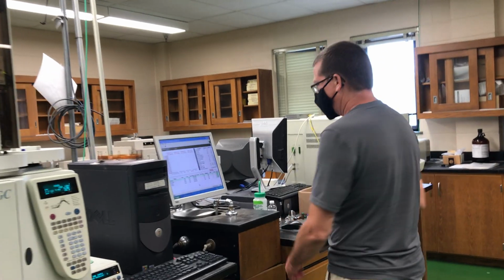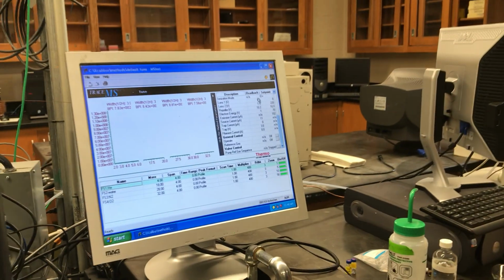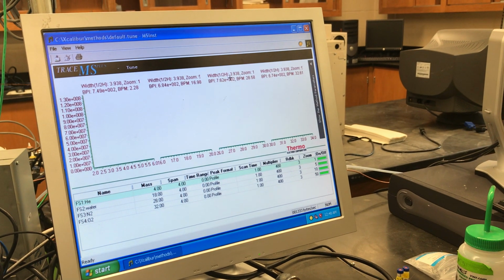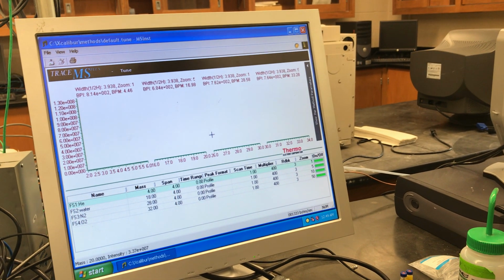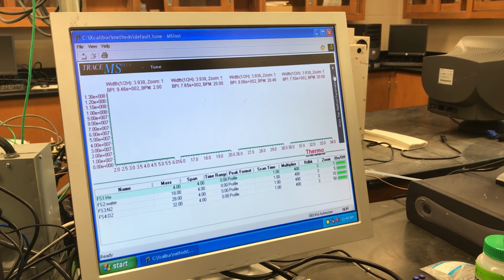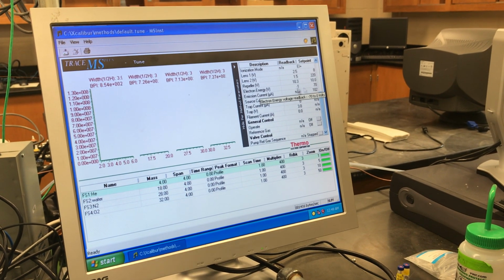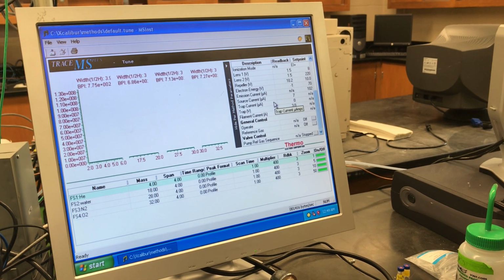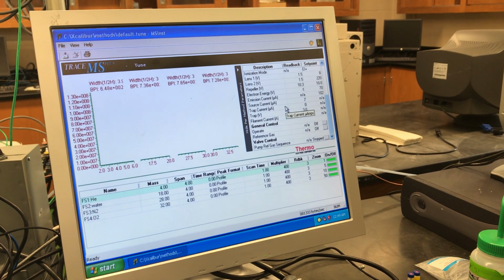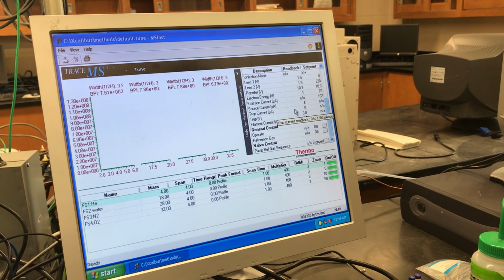Now at this point, I'm looking here to the right at my readbacks here. Now, we can toggle between this screen and this screen by hitting the gray bar here, and you may find that when you enter into the software, you may not see the readbacks. So if you need to look at the readbacks, just left click on the gray bar and you can open up that menu. Now, these are various readbacks that we're getting, for example, that correspond to either temperatures or voltages applied to the mass analyzer itself, so that it can be in optimal operation.